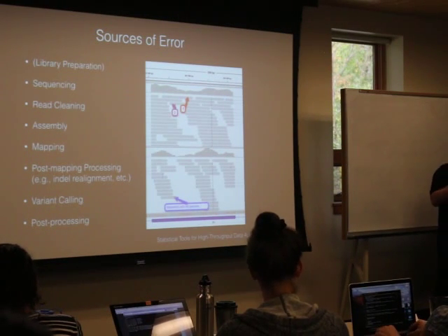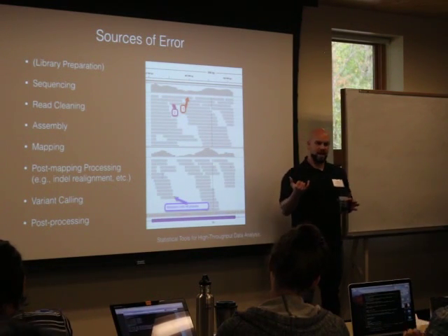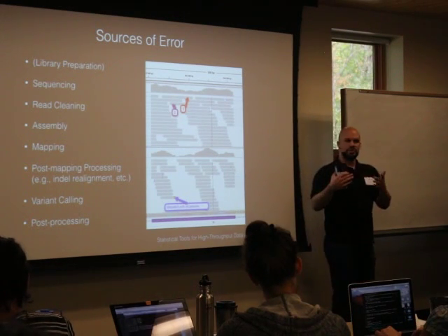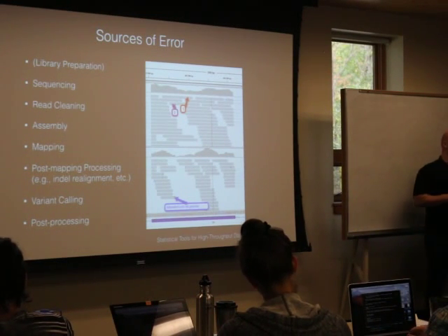And then you might actually want to go through and process the mapping in a particular way that allows you to make sure that you're dealing with reads, again, not necessarily just the quality of the reads, but that we have high confidence that those reads are placed appropriately in the context of our entire genome. You can then go through and do some processing of that.